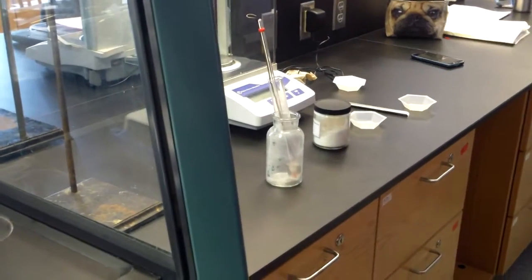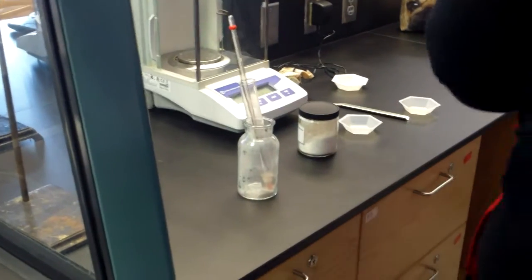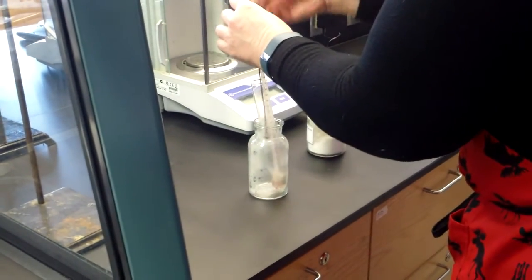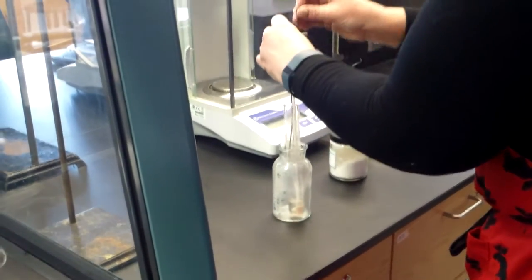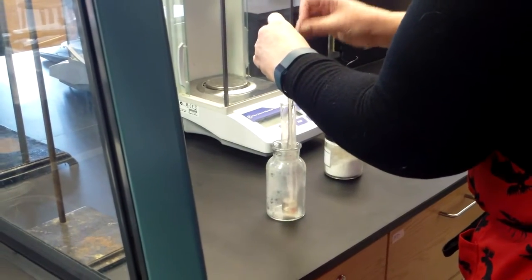You'll read the temperature. You will get your cell phone, set your stopwatch, and you will take the temperature every 30 seconds as you stir. And you have to stir, otherwise it will cool unevenly and you'll get crystals and it won't work at all. We good? And you'll keep stirring.